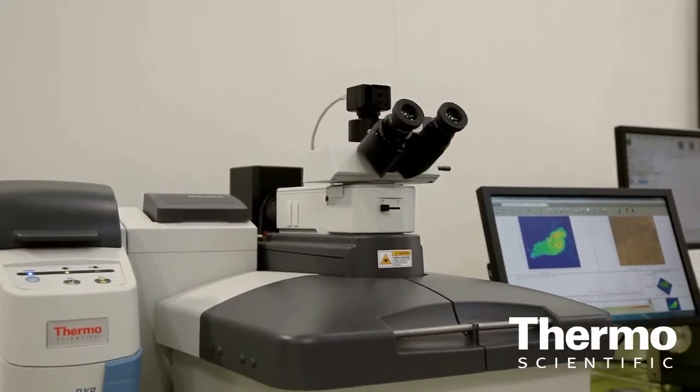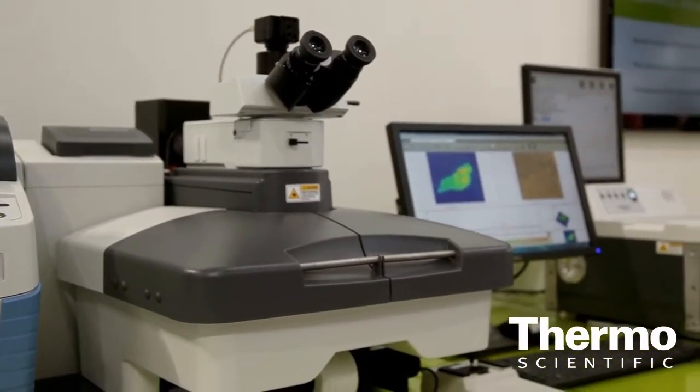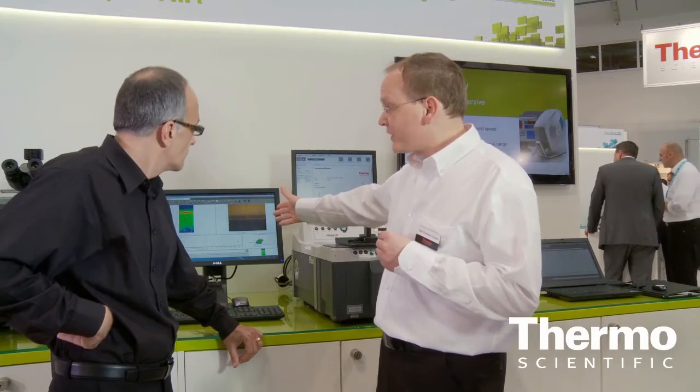But you can also measure very large areas. You can do area mapping, and it is displayed here: a cross-section from a multi-layer system. So you can identify each layer and say, okay, layer 1 is such a polymer, layer 2 is such a polymer, and so on and so on. And it's very easy with such a Raman instrument.